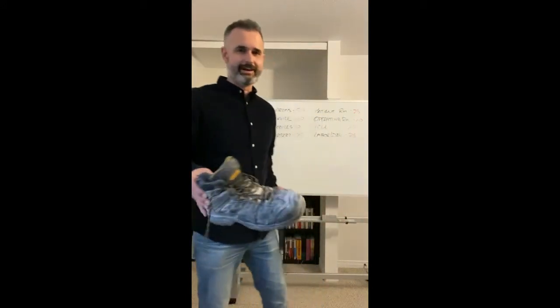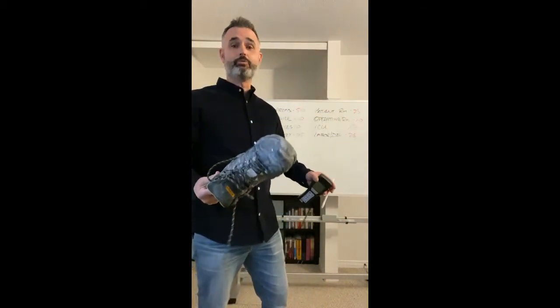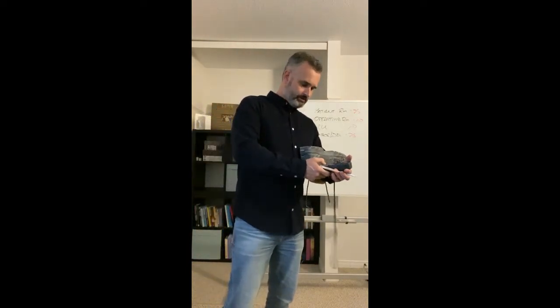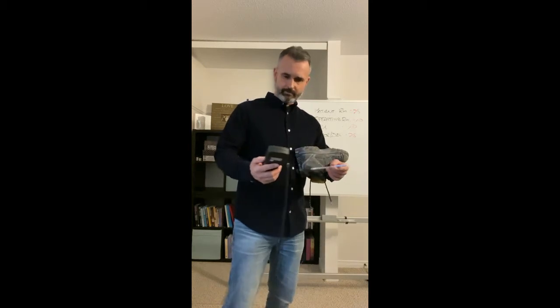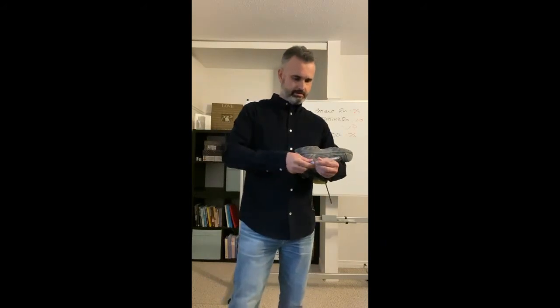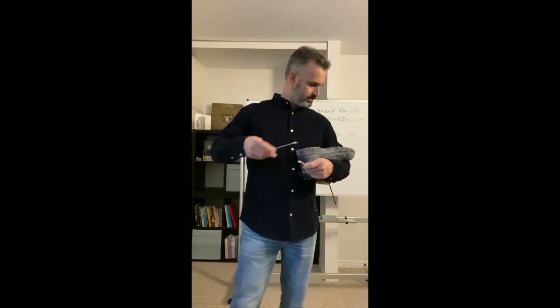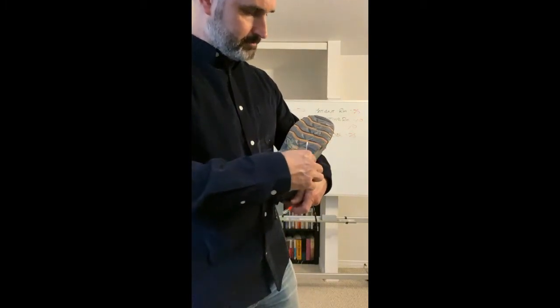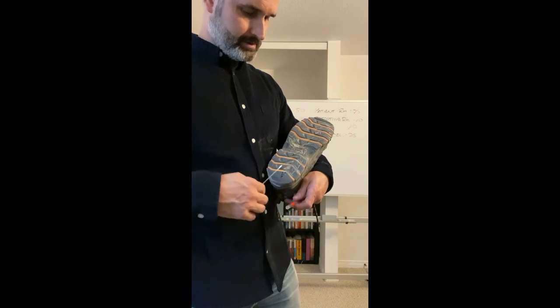So we're going to start by getting a number off the bottom of this boot. It hasn't been cleaned ever, I don't think. So just to give us an idea, a gauge as to what we would expect on different types of surfaces. So we'll just get this guy on here. He'll take a second to calibrate. And while that's calibrating, we will take a swab and get across that nasty gum. And we'll just go across the bottom of the boot here.